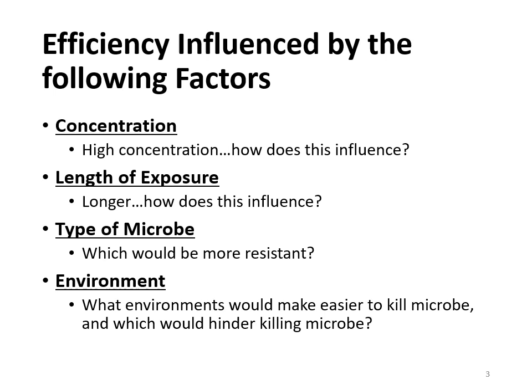Now, no matter which of the antimicrobials you're using, there are a lot of different factors that can affect how good of a job these antimicrobials are going to do. Basically, when we talk about the efficiency of them, we're talking about how good of a job they do getting rid of microbes. So one thing that influences them is concentration. In lecture, we talked about the concentration of the microbes affecting the antimicrobials.